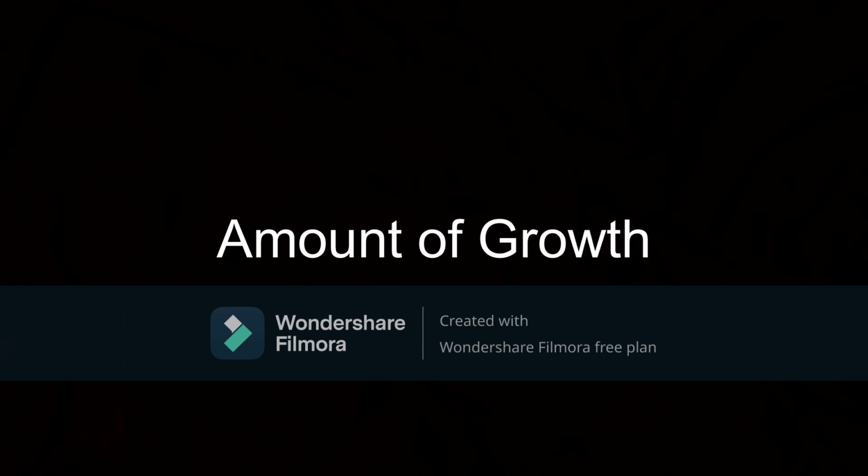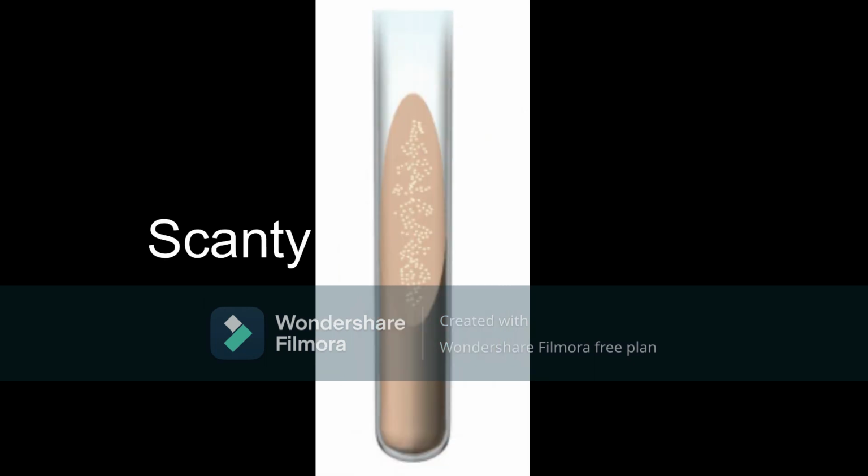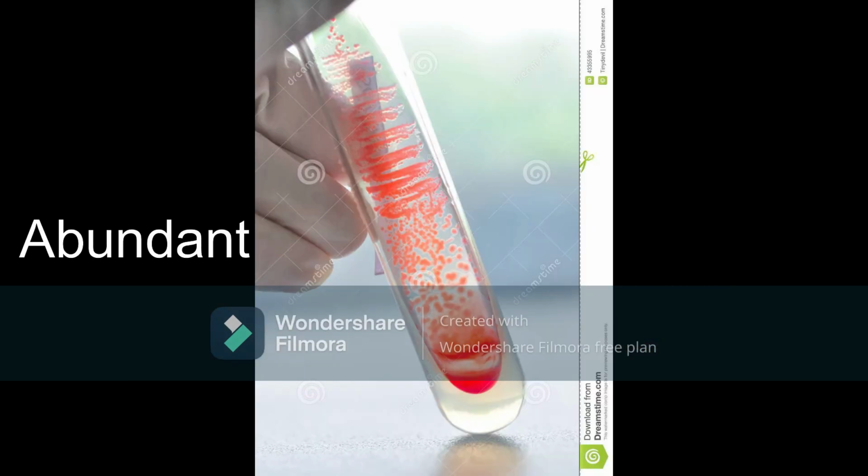Amount of growth. It can be none, scanty, moderate, and abundant.